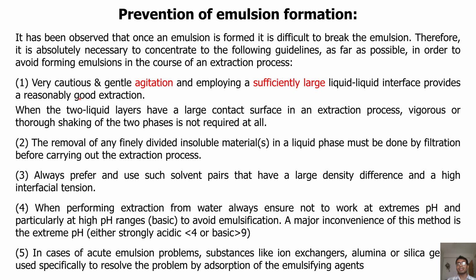So whenever you mix one solvent with another, please make sure that your separating funnel is stable. Okay, it's not vibrating and you are not shaking it, because after everything settles down, if you cause some vibration or some mixing, then yes, this may form emulsion. So always prefer gentle agitation.